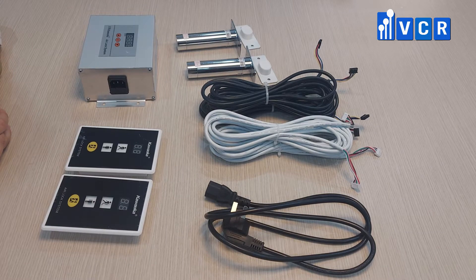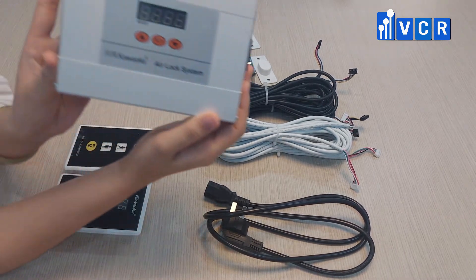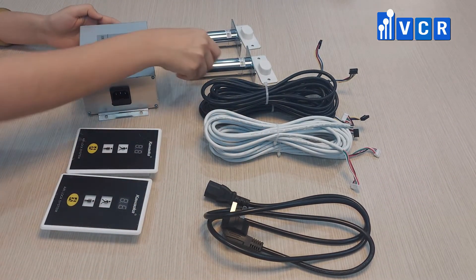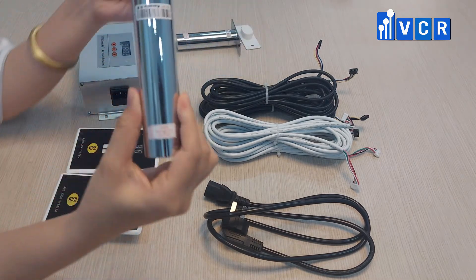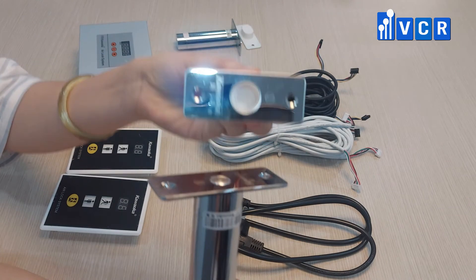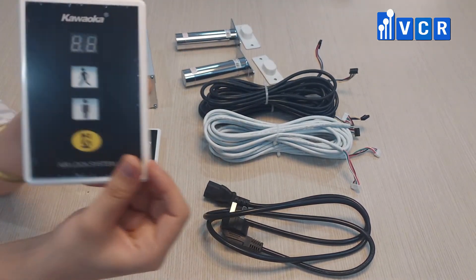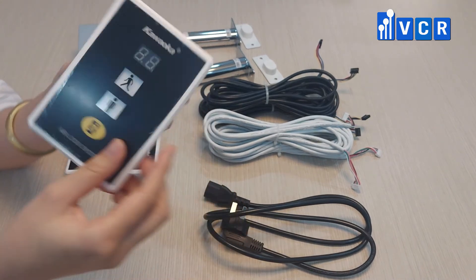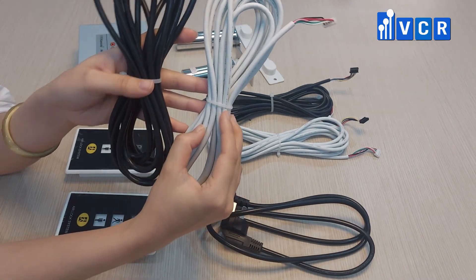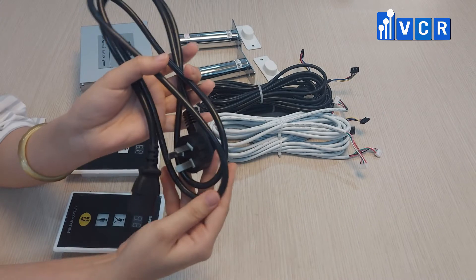A set of cleanroom interlock includes a control box, electric locks and lock sheets, light panels, signal cables, and a power cord.